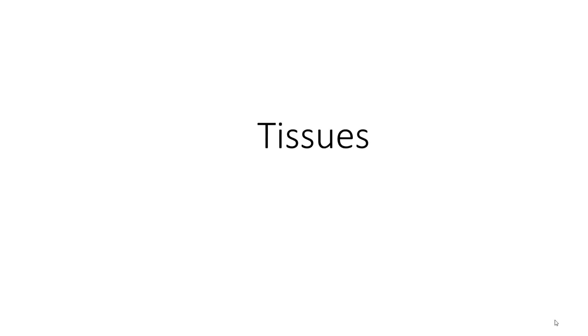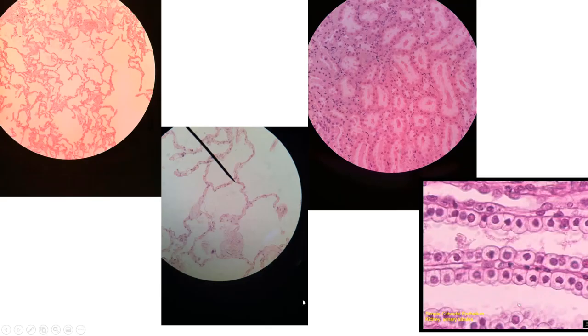This is the laboratory lecture about tissues, so the histology section. These are the microscope slides that you need to be familiar with for the tissue drawings and also for exam purposes. So I'm going to go through these in the order that they're on your tissue drawing handout. And remember that assignment is worth 50 points. So make sure you get that done on time.